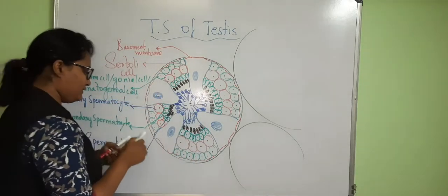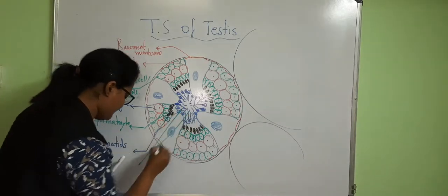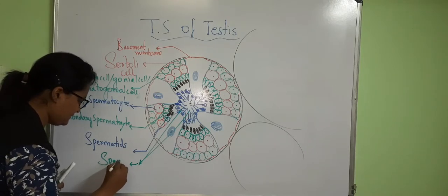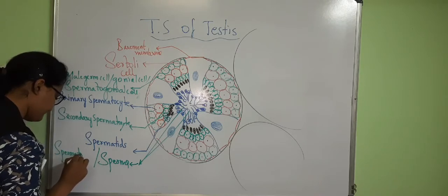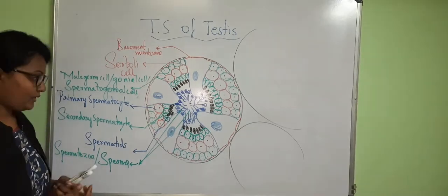all these are sperms, or also called spermatozoa.